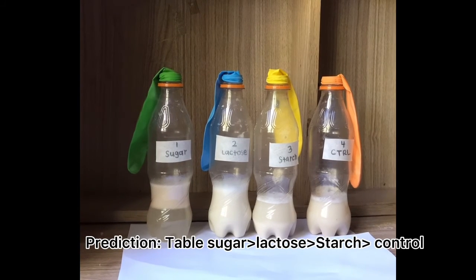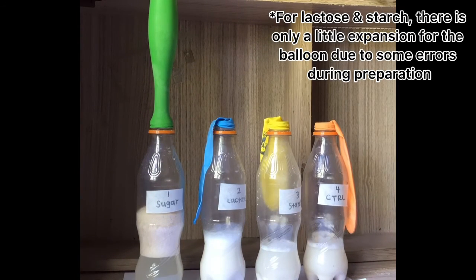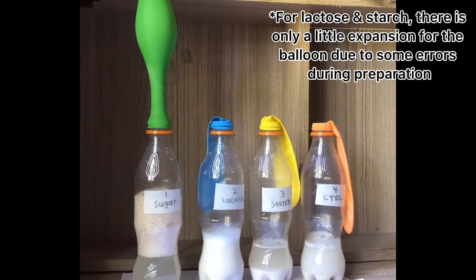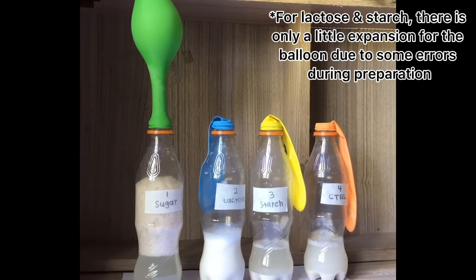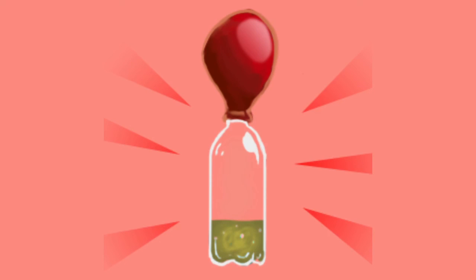Based on the result, the carbohydrate that is added into each bottle will act as an energy supply for the yeast to undergo the fermentation process. The rate of fermentation can be determined by the size of balloon expansion for each sample. The balloon expansion indicates that there is a carbon dioxide release from the fermentation process which is trapped inside the balloons.